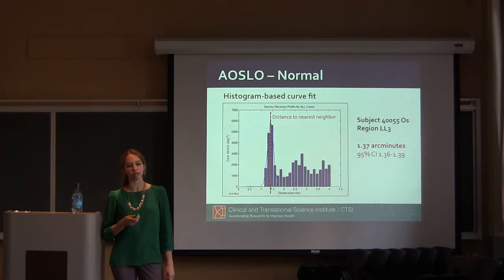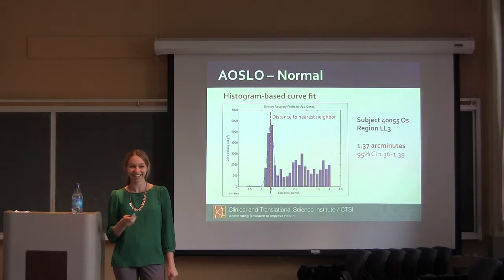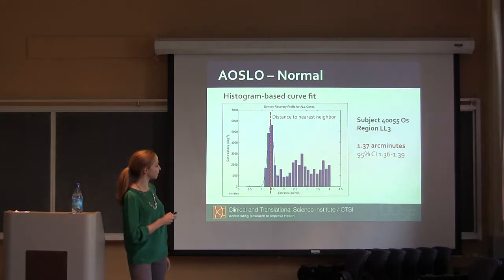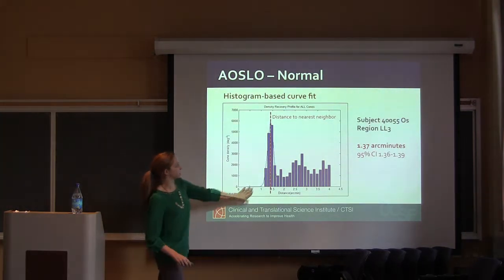So I know it's a little confusing. Does anyone have questions about what I just said? Or does that make sense? That makes sense. I feel like this histogram, the fit sort of isn't the best fit. You can sort of see additional peaks to the right of that. Exactly. So great point.